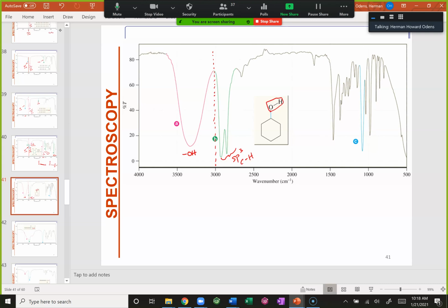For this case, you might see something like you can say, okay, these CH2s are equivalent to that CH2, right? And they are closer to the electron withdrawing oxygen. So I would say if I had to assign that peak, it will be those two signals. It will be that peak.